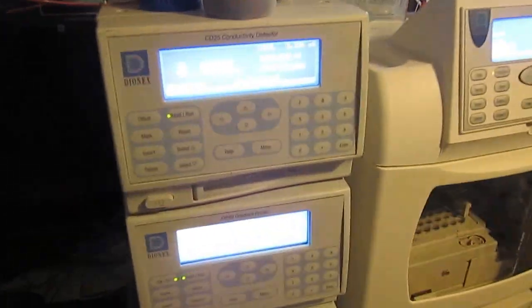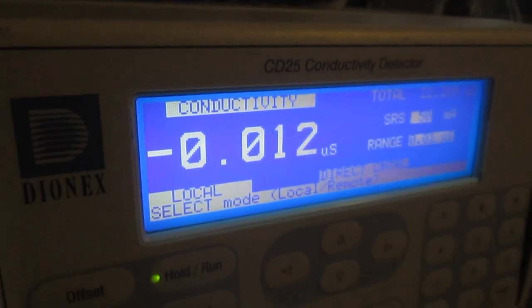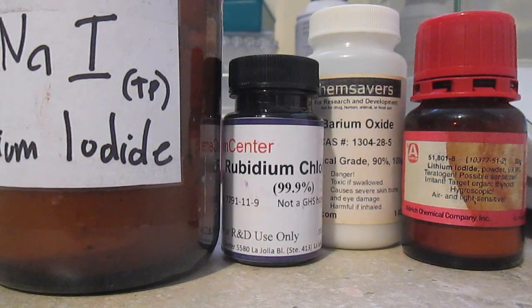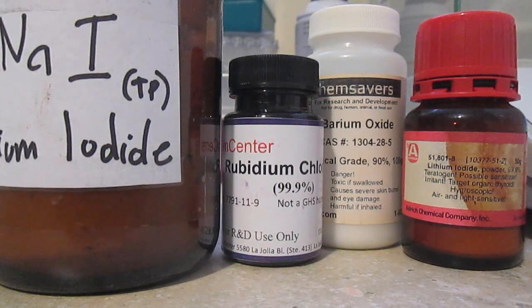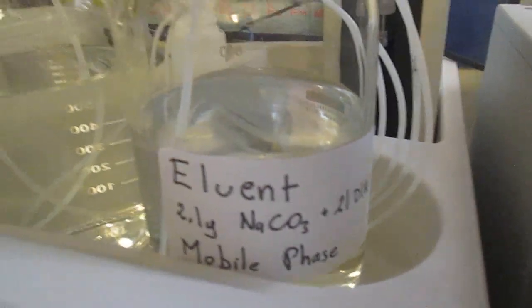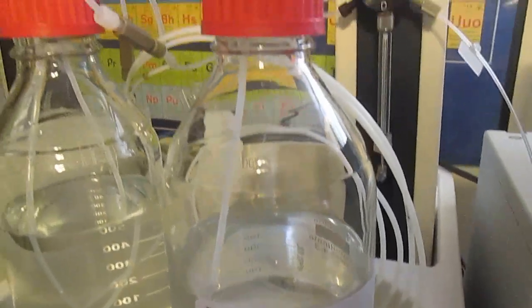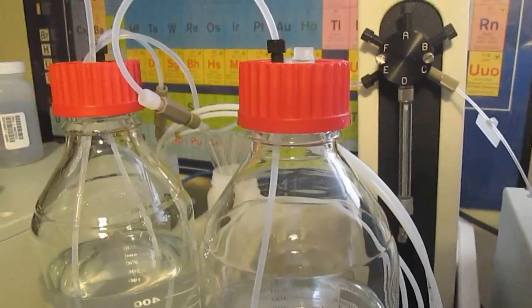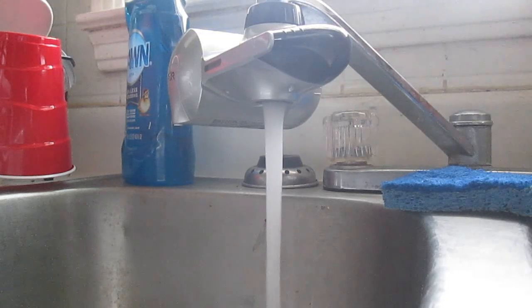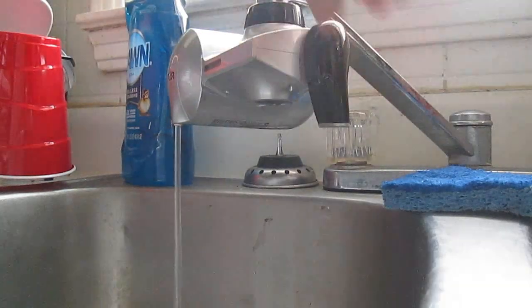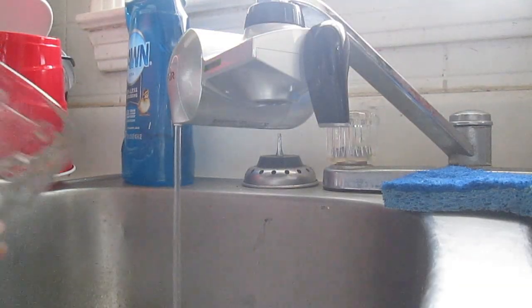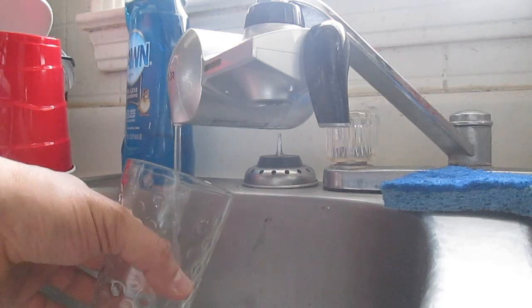Okay, cool. But what is it good for? As the name suggests, ionic species can be detected. Here's a few examples of analysis I'm planning to carry out: fluorides and nitrates in drinking water, and verify how good my filter is.